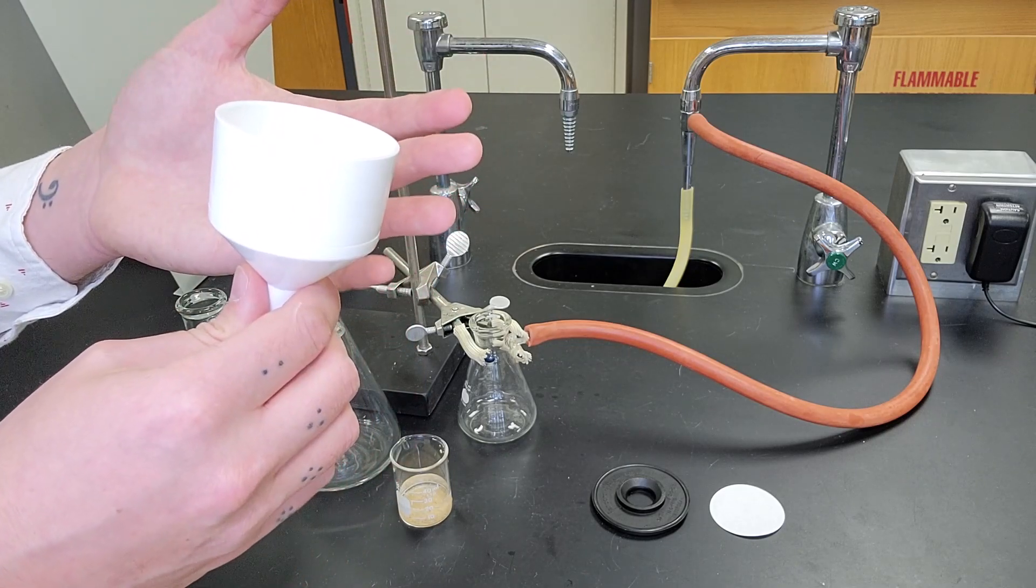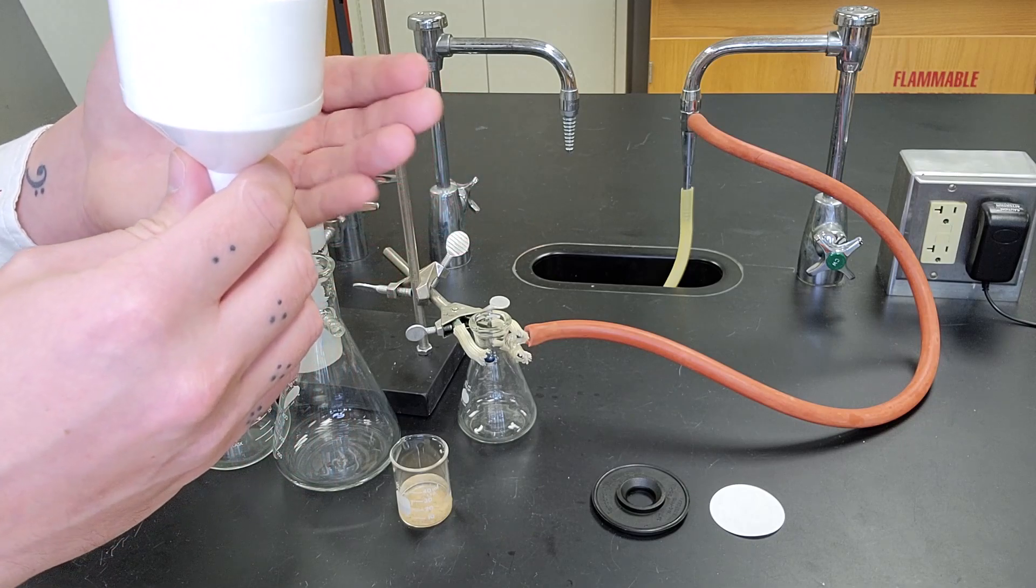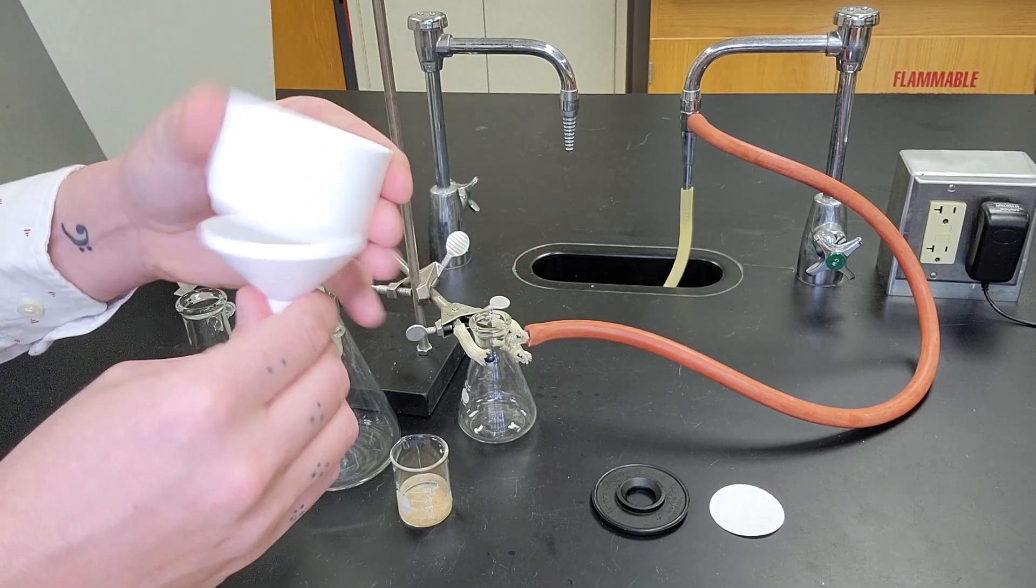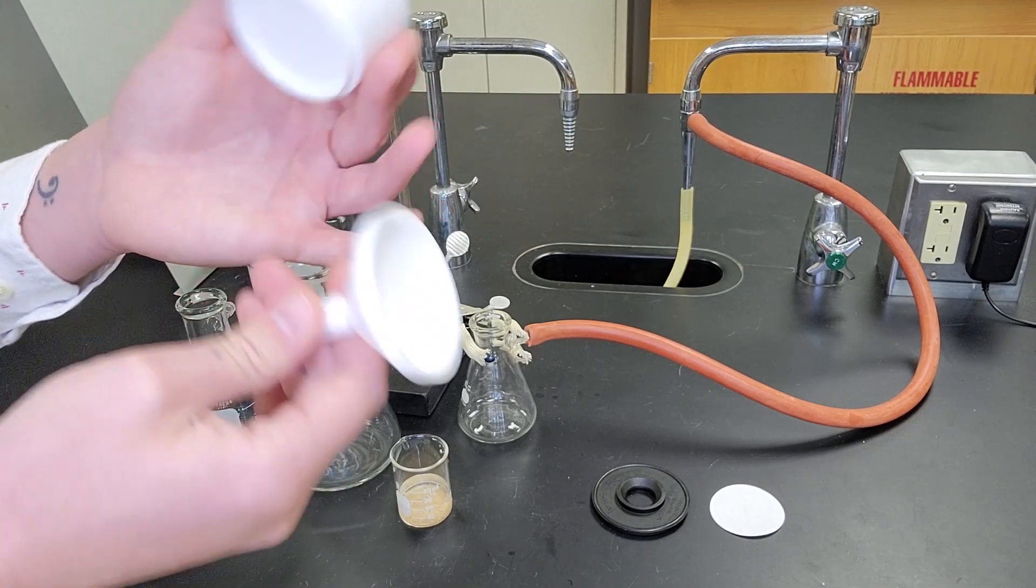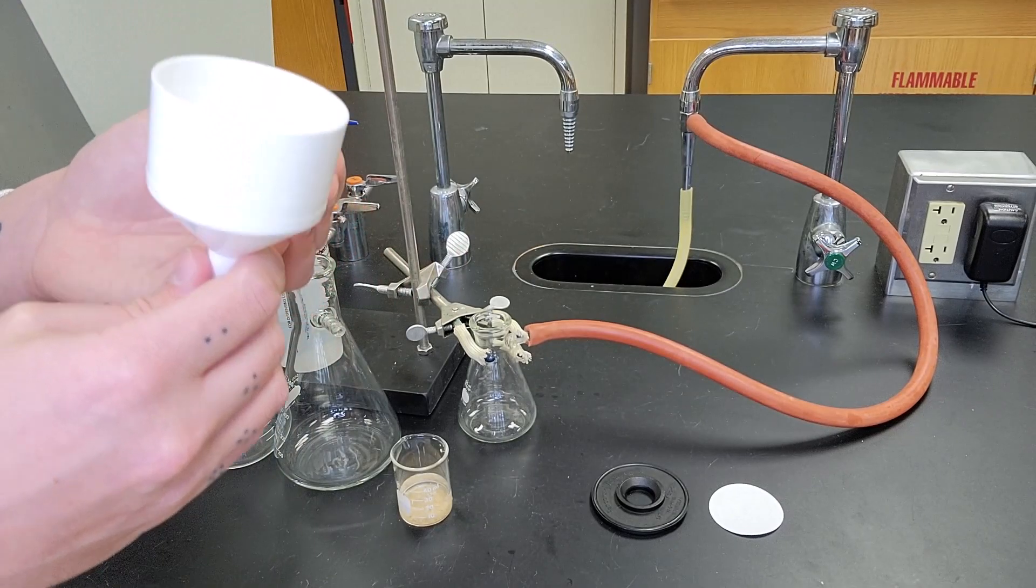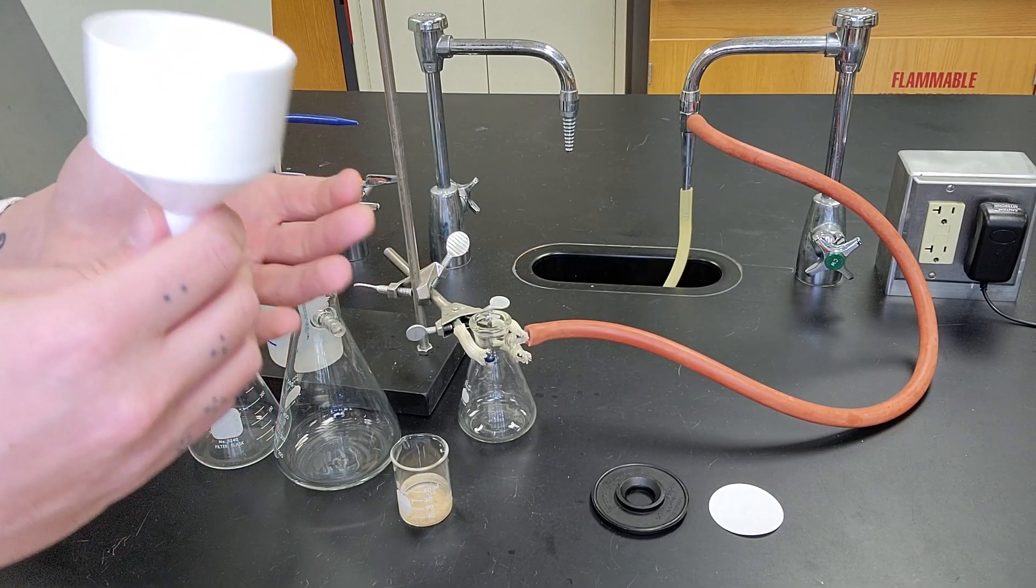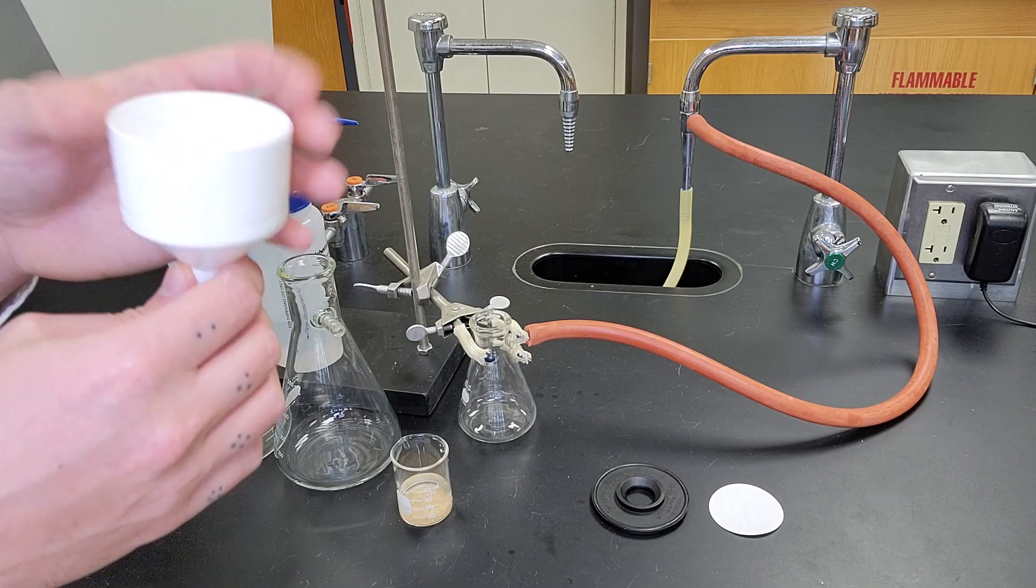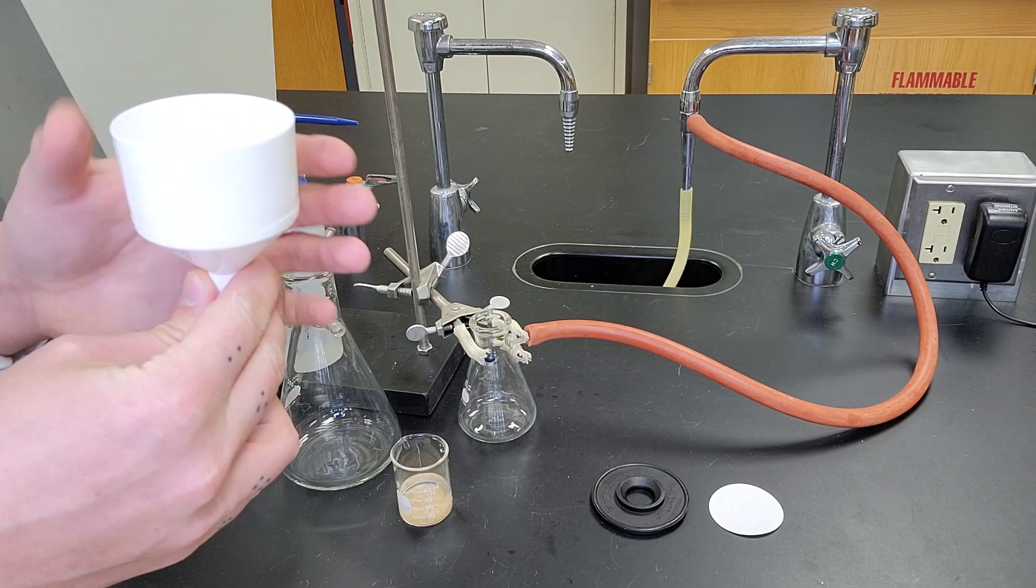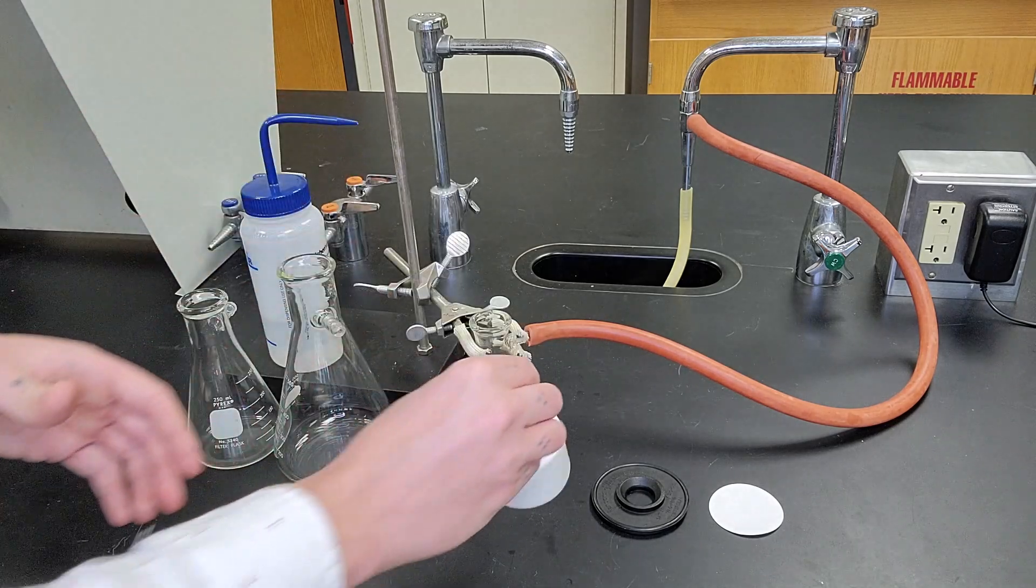This is a plastic Buchner funnel. They make glass ones and ceramic ones. The nice part about these plastic ones is the top and bottom come off for easy cleaning, but ceramic ones are a little more common in research laboratories. The plastic ones do get stained and are not as efficient as the ceramic ones.